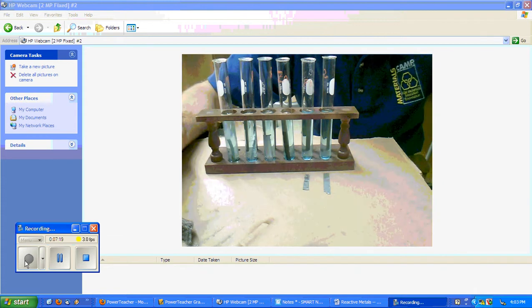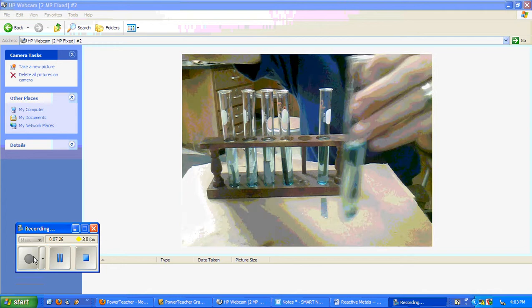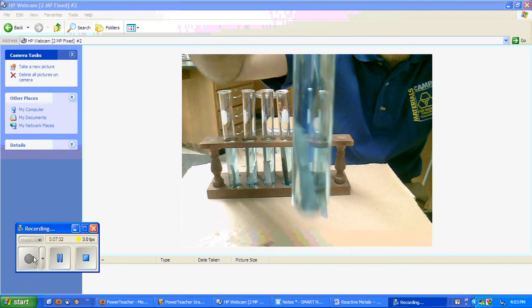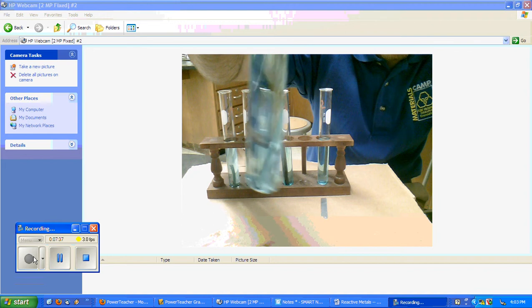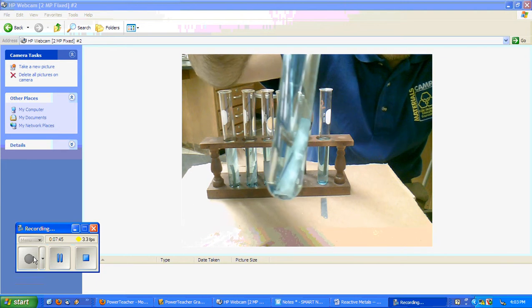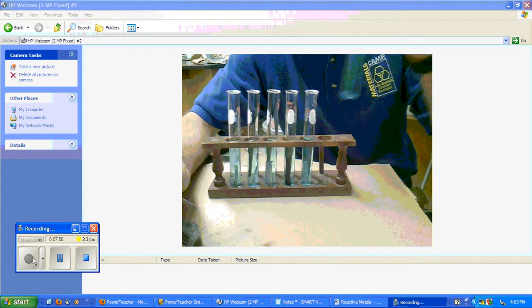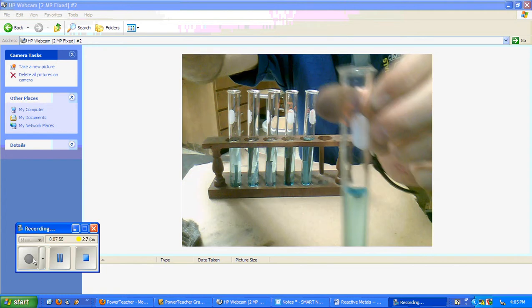Probably because my screen's really tilted down. Alright, so next up we'll do lead. Alright, so lead starts off nice and shiny too. Okay, that's lead. Alright, so the last one is tin. So starts off shiny. Yay, shiny.